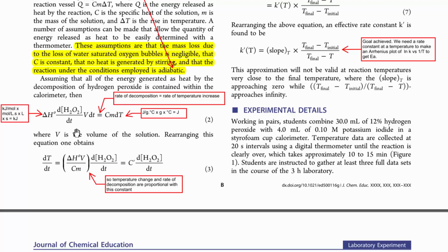So the rate of reaction is the change in concentration. The amount of volume matters, and the enthalpy of the reaction is going to affect how much heat is given off. So that should equal how quickly the temperature should rise, using the various equations. I thought that through in my head for quite a while and was okay with that.